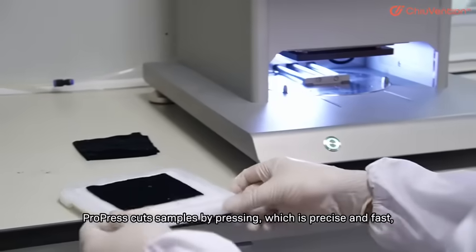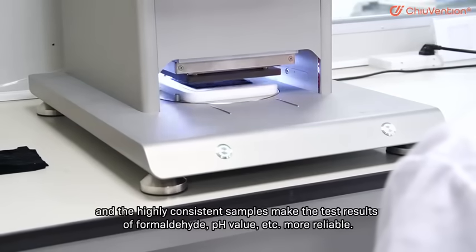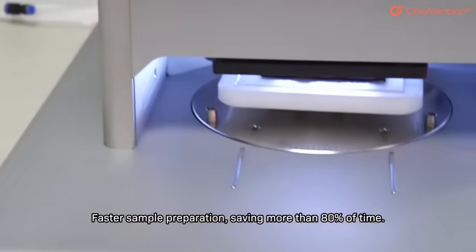ProPress cuts samples by pressing, which is precise and fast, and the highly consistent samples make the test results of formaldehyde, pH value, etc. more reliable.